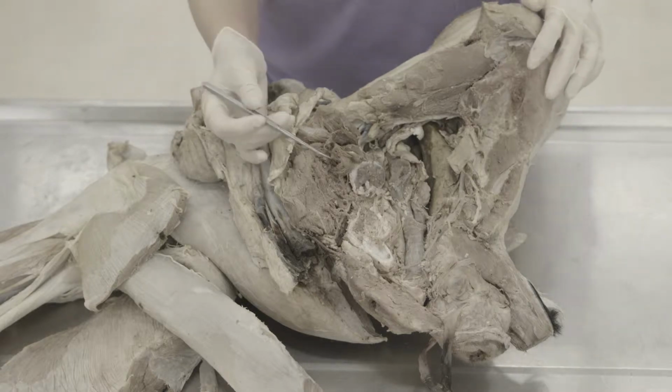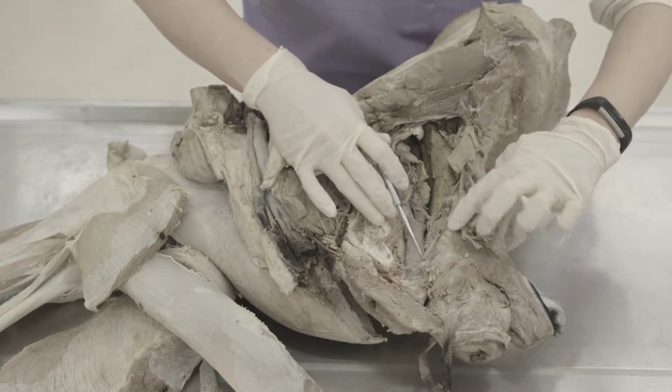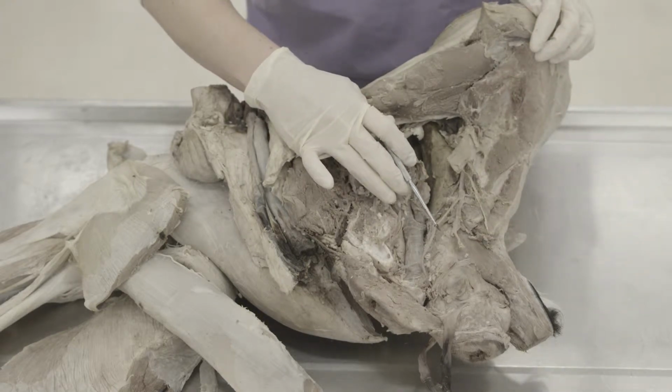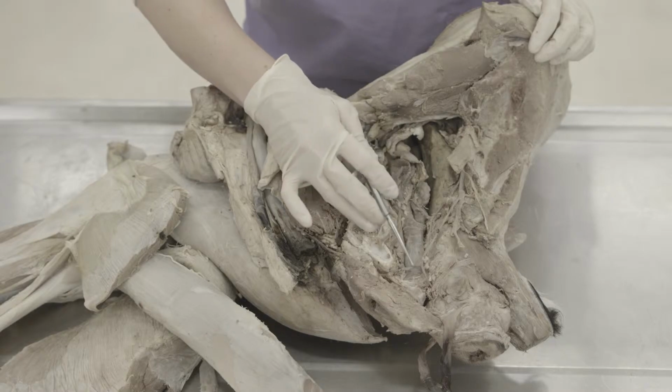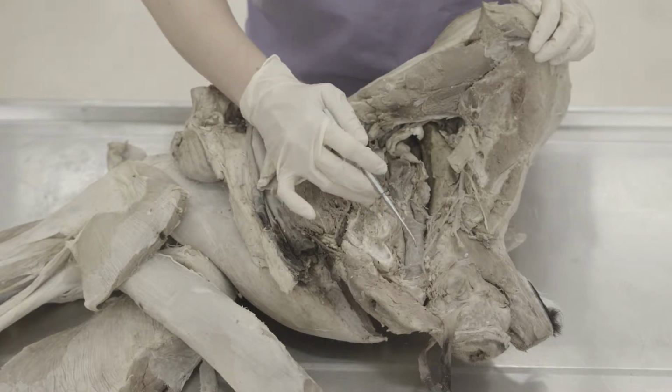So after you do that, you're going to work on some of the vessels, and I just want to note that you want to be very careful when you remove that pelvis, because as you can see here, I cut through my vessel, so you don't want to do that if possible. And I sutured it back together, so hopefully I can still show it to you. But you want to be really careful when you're cutting away that hemipelvis when you're on the left side here.